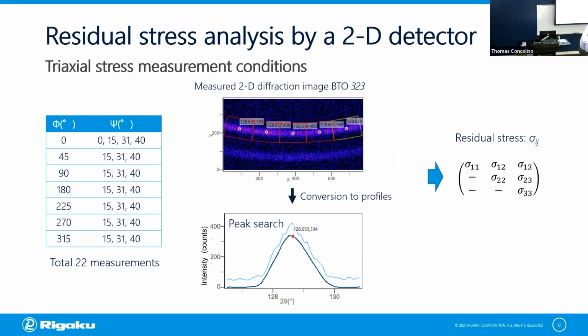So you see a beautiful Debye ring from the barium titanate. On the software side, we split the Debye ring into a couple of different regions, and the software integrates the intensity and tries to fit a profile like this by a profile fitting procedure. The purpose is to get the deformation of the Debye ring because of stress as precisely as possible.